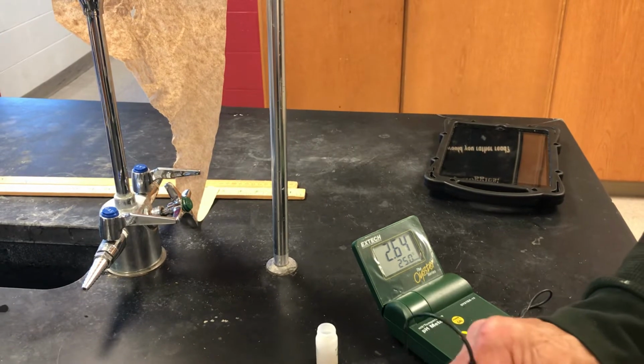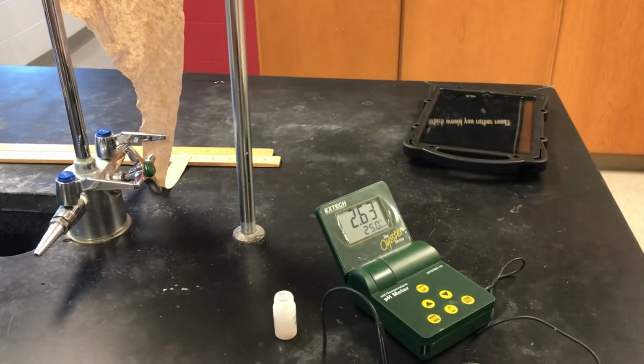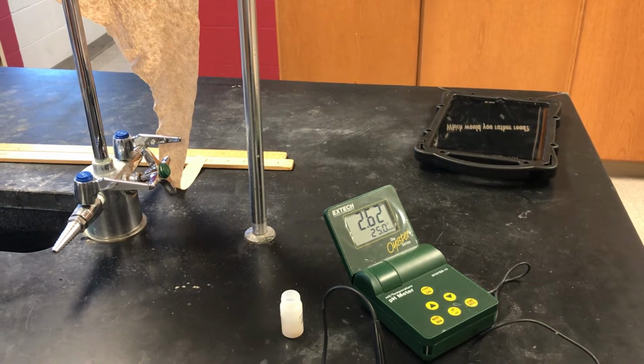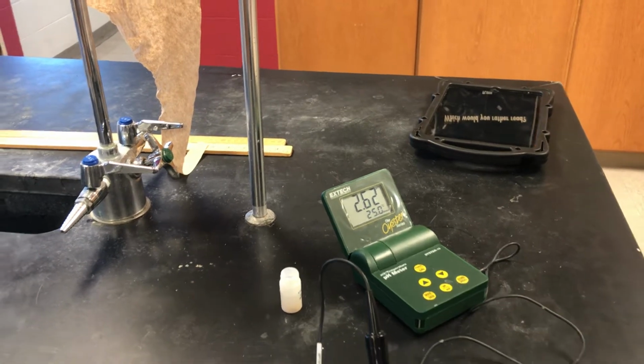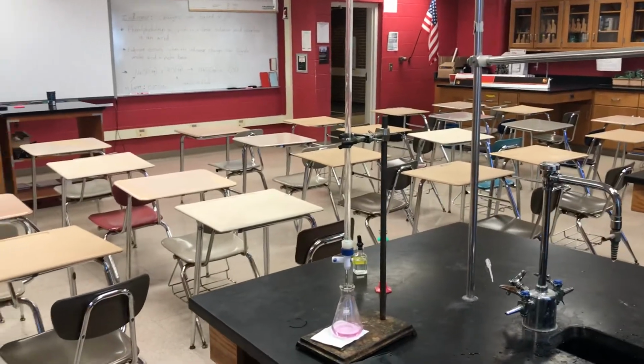Let me swirl it good. I should have probably rinsed the electrode off and I didn't do that. 2.62. There you go. So we can find a concentration of the acid from that.